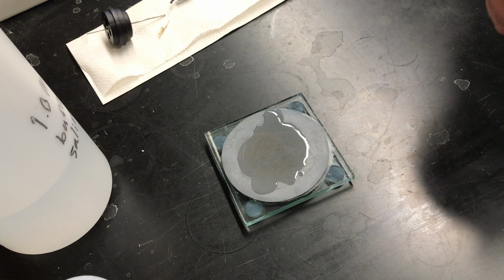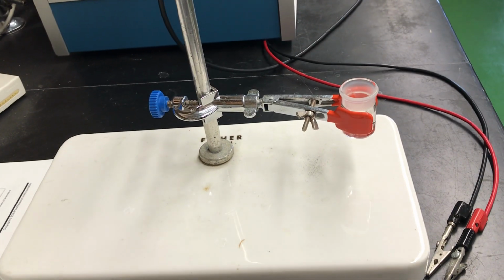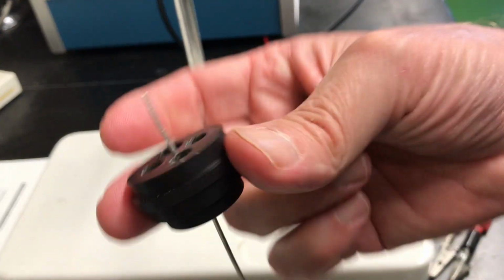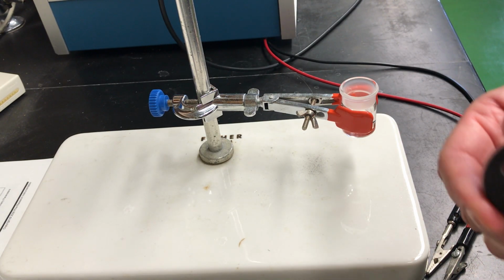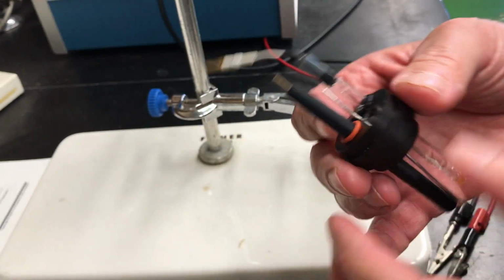Now the next thing that I want to do is set up the electrochemical cell. So I'm going to now focus on the cell itself, and I'm going to put the electrodes together into this little cell holder here. Okay, so what we can do is come back around, place the working electrode in there along with the auxiliary electrode. We'll also pick up the reference electrode and place that in there as well.